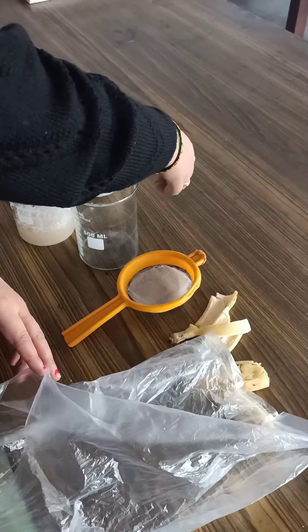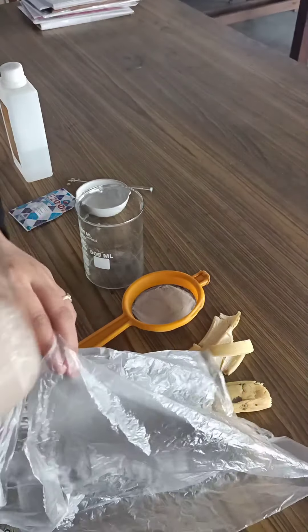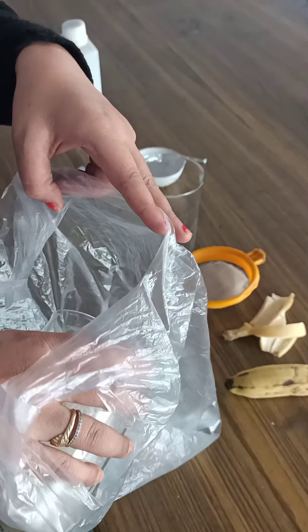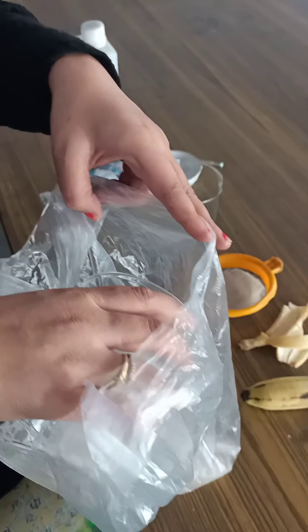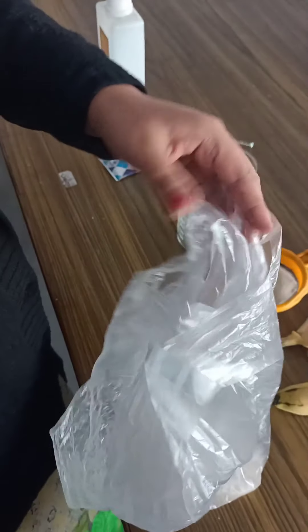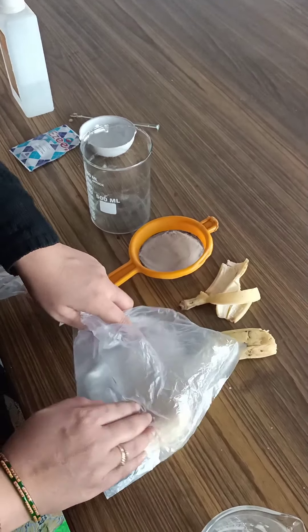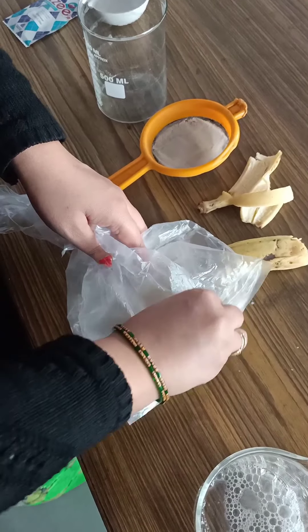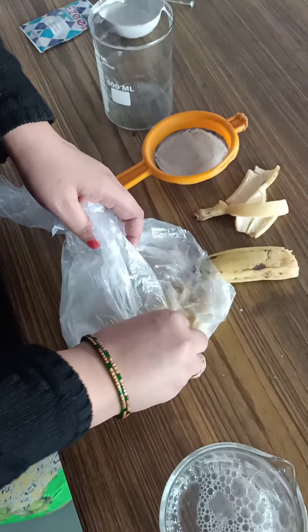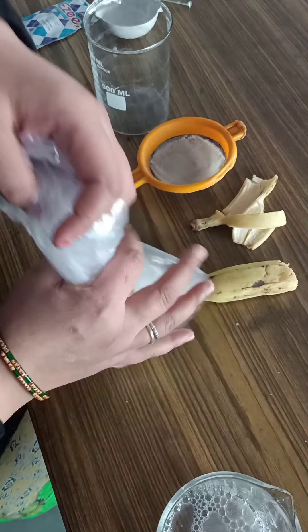After adding the detergent, stir it properly so that it mixes well. The purpose of using liquid detergent, salt, and distilled water for extracting DNA from banana is that it will rupture the wall of the cell, and as a result the nucleus will come out. We know that the nucleus contains chromosomes, so we will be able to see the chromosomes or DNA from the banana.